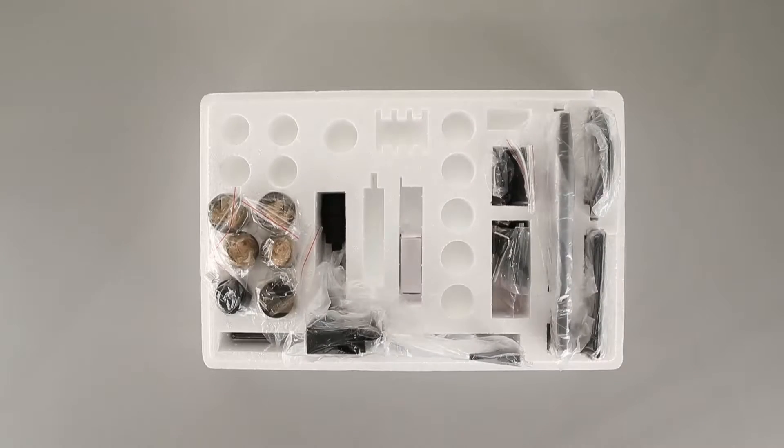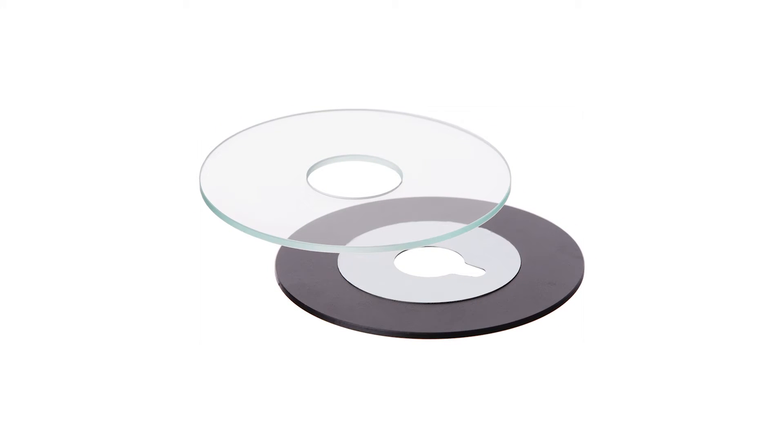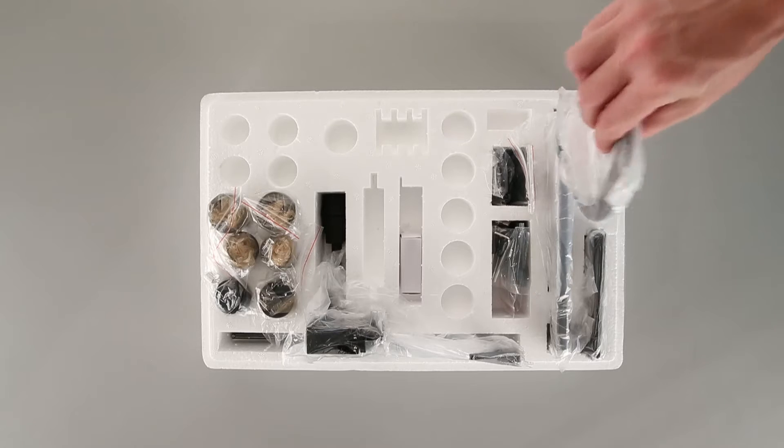This microscope comes with two stage plates. One is a transparent glass plate, the other is metallic. We'll use the glass plate for now.